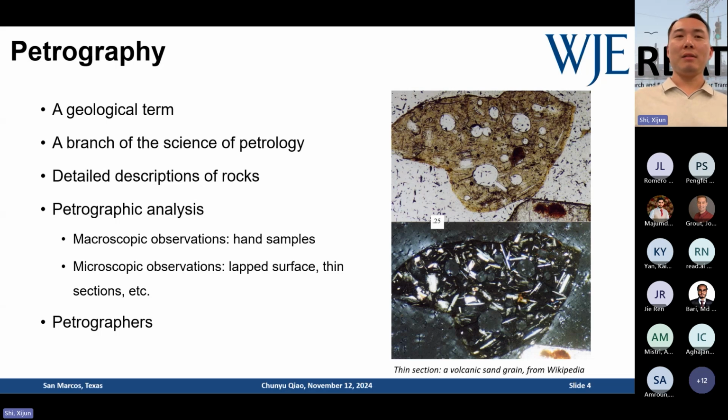So there's a way, we call ourselves petrographers, not photographers, but we do share some similarities because petrographers use microscopes to take images and photographers use cameras to take pictures, but we all focus on details, the information behind what you're going to take. So the photo I'm showcasing on the right is a thin section photo from a rock. So you can see that's a basalt rock.